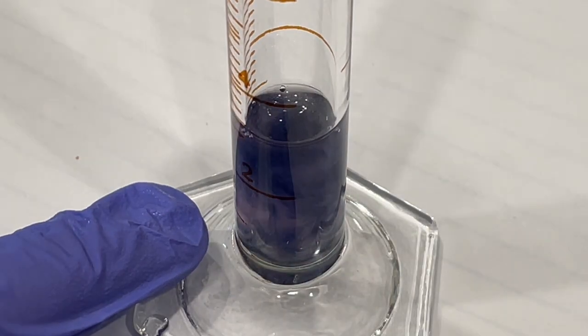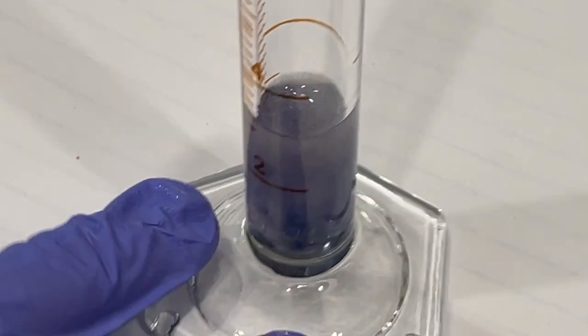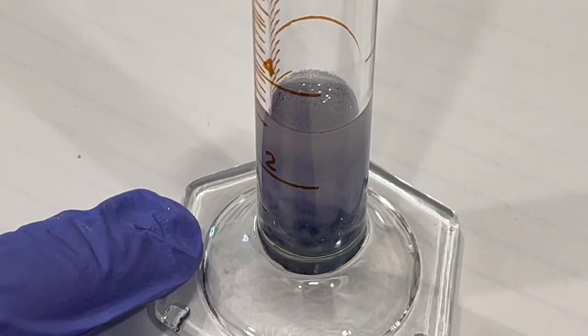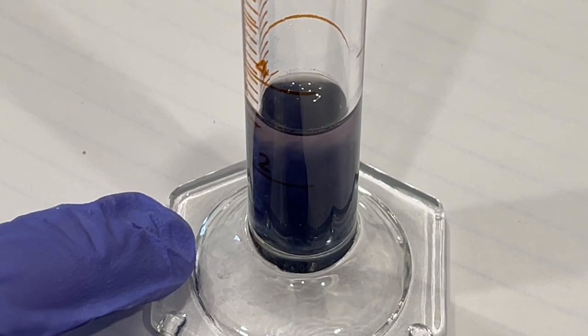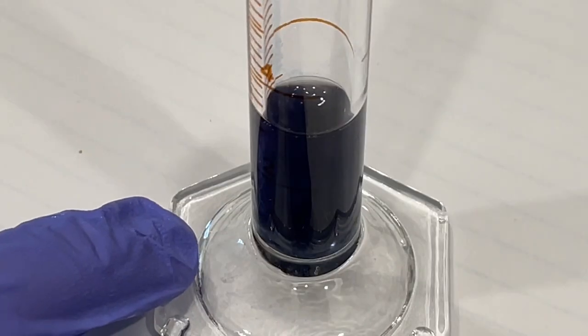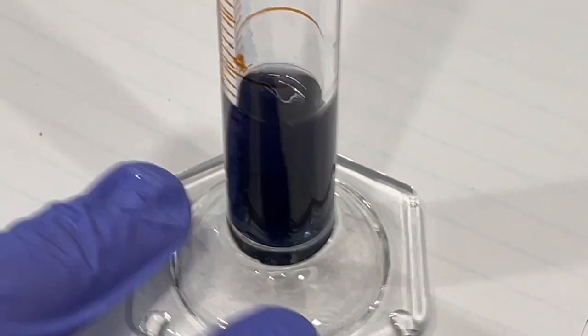This probably indicates that the Briggs-Rauscher reaction is very sensitive to its initial conditions. Indeed, in the original research papers on this reaction, they found that this was the case. To get more consistent results, I could probably use larger volumes, and in that way, there would be less variation in the overall concentrations of the reaction mixtures.